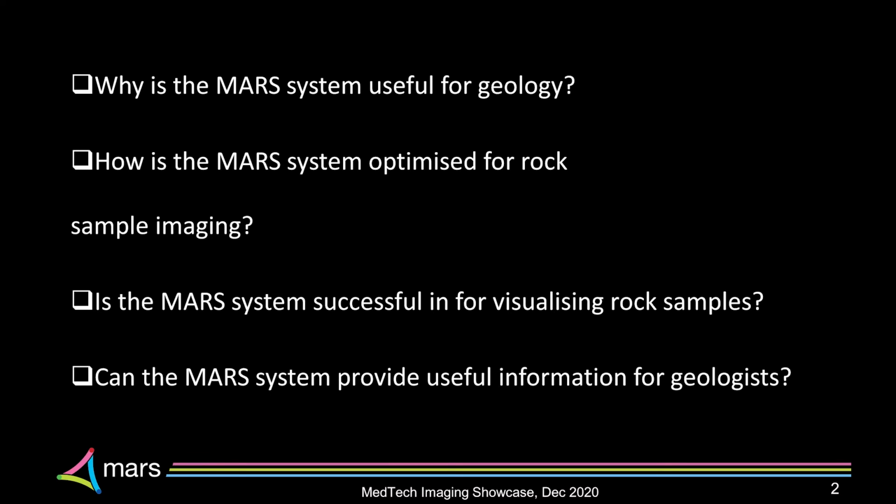So we're going to answer these four main questions today. Basically, why is Mars CT useful for geology? Can the Mars system be optimized for scanning rocks? Can we successfully visualize rock samples and provide superior information to geologists?